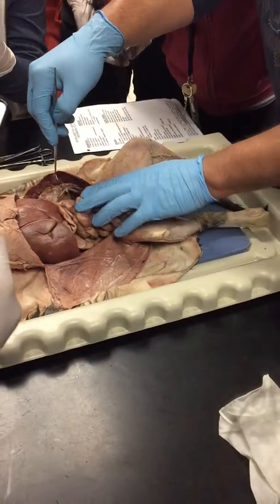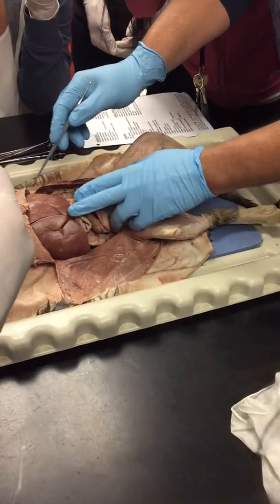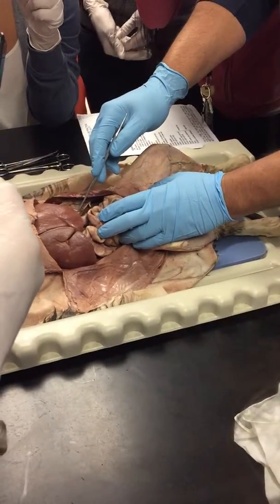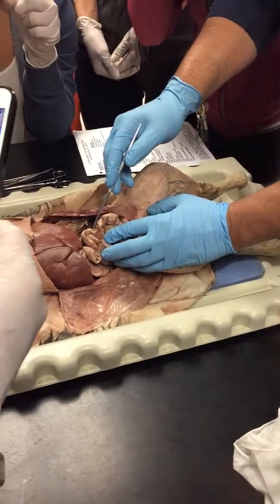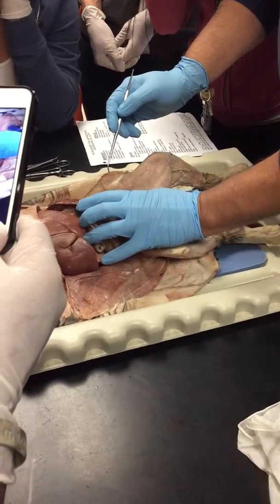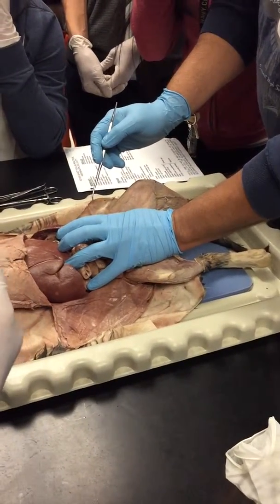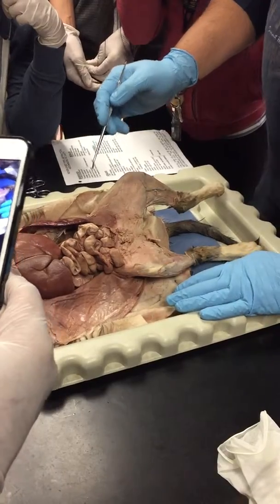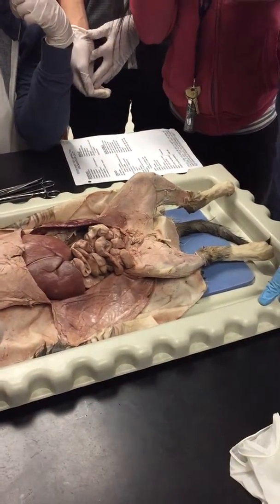And then the outermost layer of all of these organs, giving them their shiny appearance? Visceral peritoneum, or also known as the serosa. Okay. There was a huge membrane covering all of this. Greater omentum. Okay.